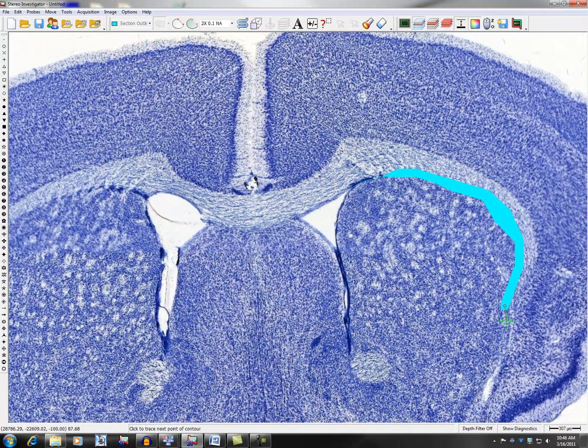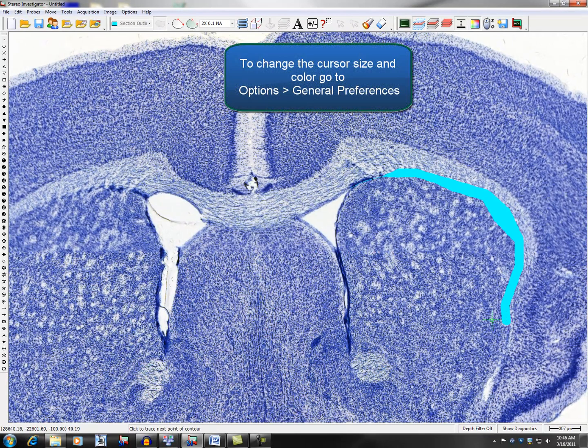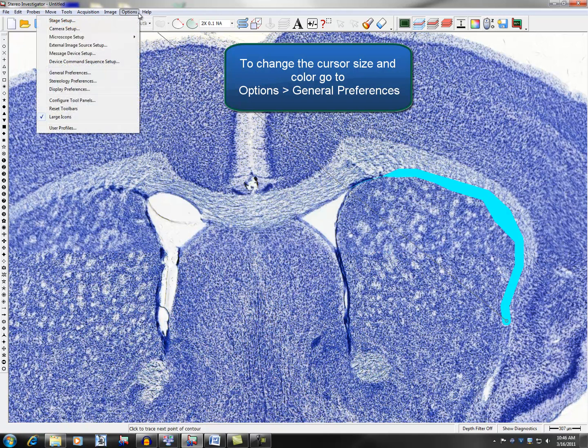For easier viewing or personal preference, you can change the color and size of the cursor. Go to Options, General Preferences.